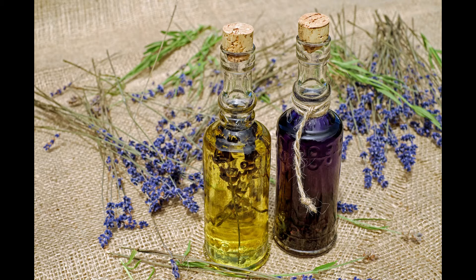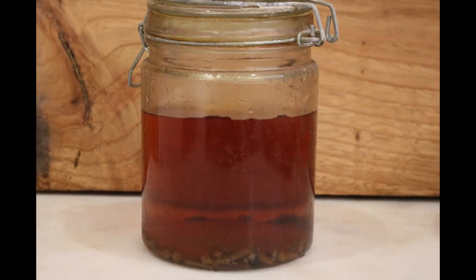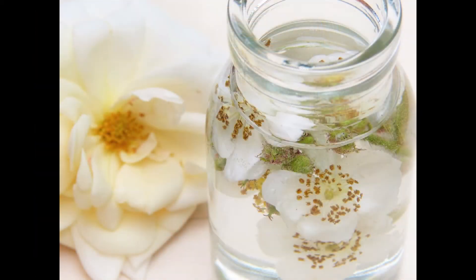Solvents can mitigate some of these issues in some cases. The product of this is called an absolute and they're produced by extracting the aromatic compounds with a solvent. Sometimes this is an essential oil, although by definition it's not, it's very close to that. The reason we use a solvent is that it can draw out the aromatic compounds in an essential oil from plant matter and other materials. It effectively separates it out in a manner that allows it to be refined.